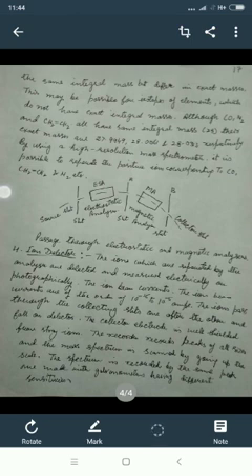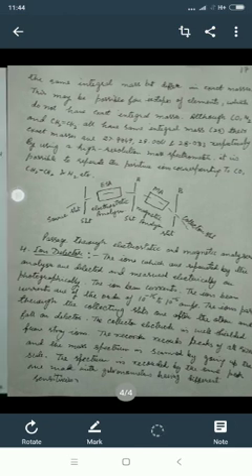Carbon monoxide, nitrogen and CH2=CH2, all these have the same integral mass 28. Their exact masses are 27.9949, 28.0061 and 28.0313 respectively. By using a high resolution mass spectrometer, it is possible to separate the positive ions corresponding to CO, CH2=CH2 and N2.